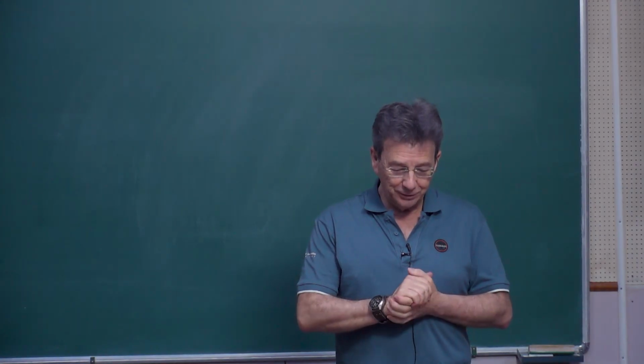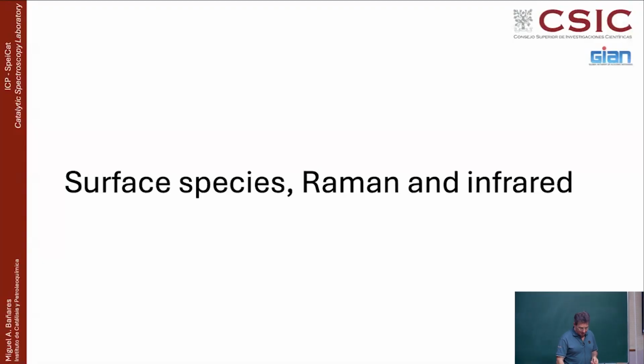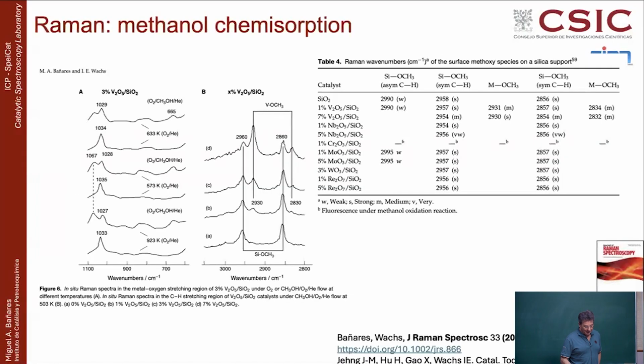So we're going to continue the session about characterization of materials. Yesterday we were talking about the complementary use of mainly Raman and infrared. We're continuing with that. Another aspect: always looking at the surface of the catalyst, we are getting very deep into the surface, because most of the interactions typically occur there. The bulk has a setting, but whatever the bulk is saying is reflected on the surface, which is where we interact with the molecules. This is why we have so much emphasis on it.